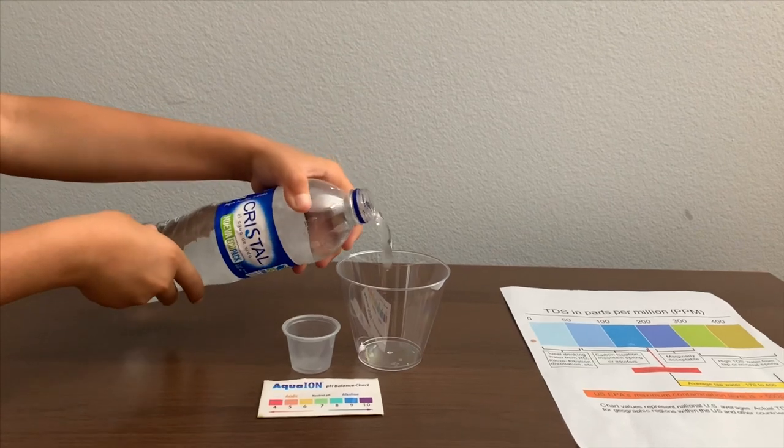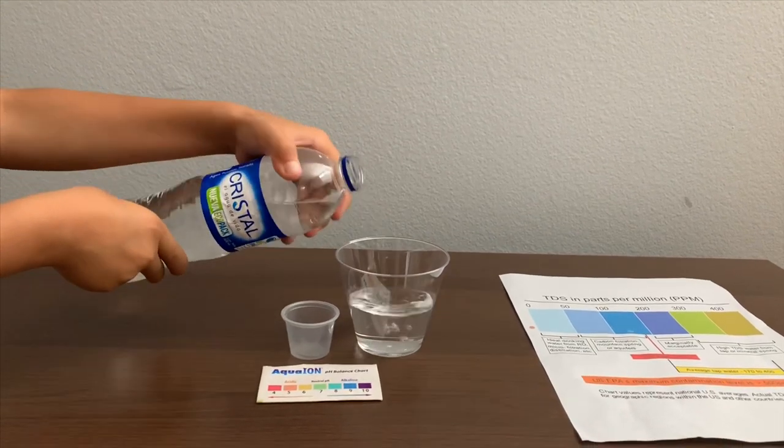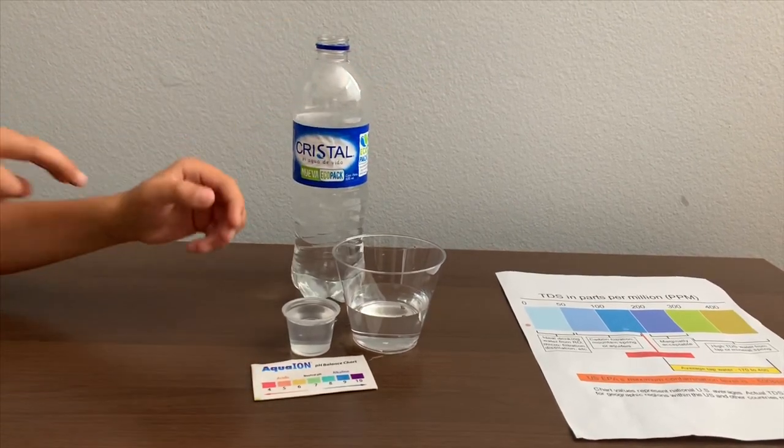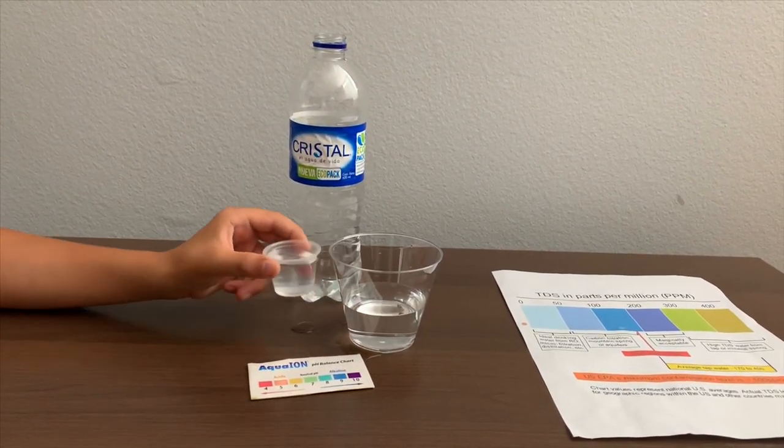Let's pour some water in. This is a little too much for the pH cup. Let's pour some back into the TDS cup.